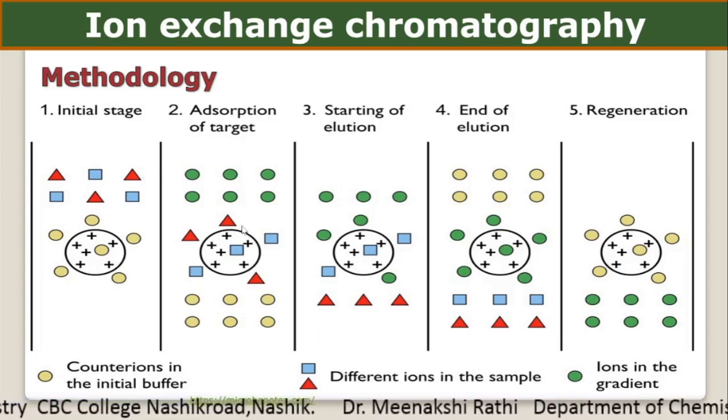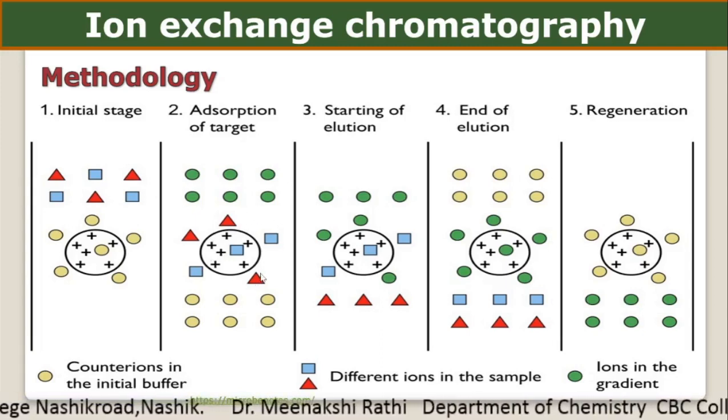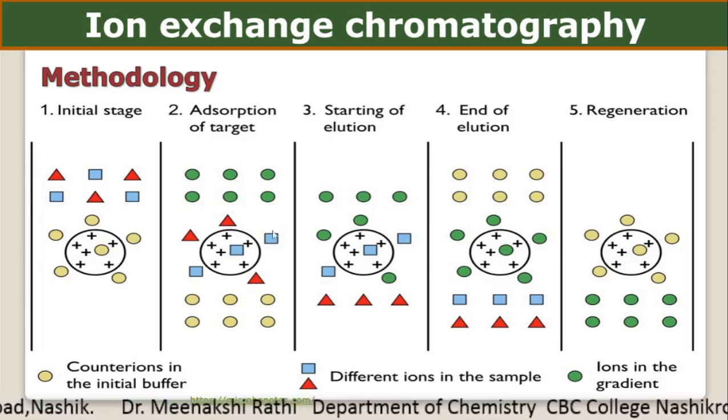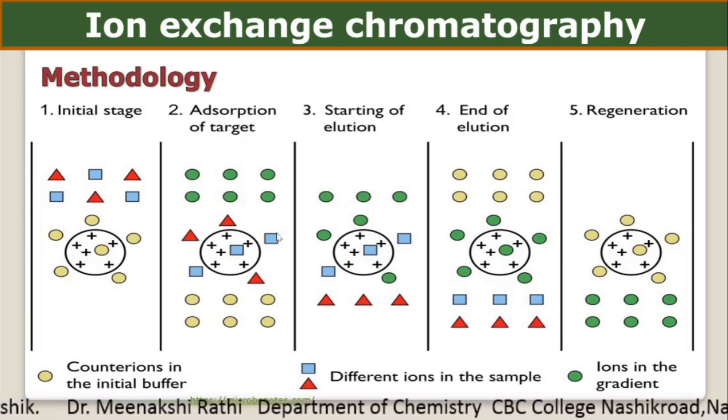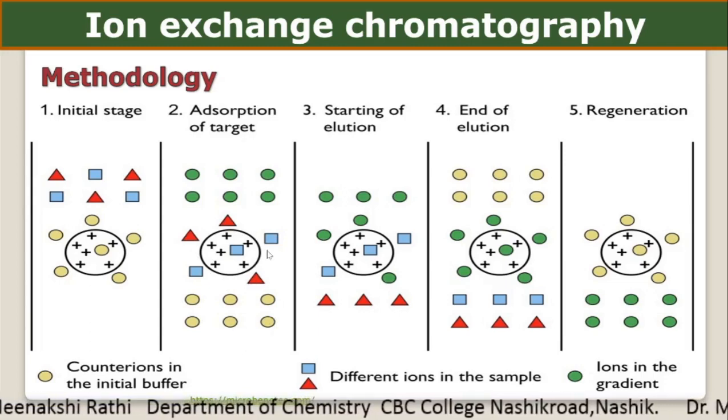Here what happened, proteins which are negatively charged replace the chloride ions and they get exchanged, and they attach to the positively charged ion exchanger.